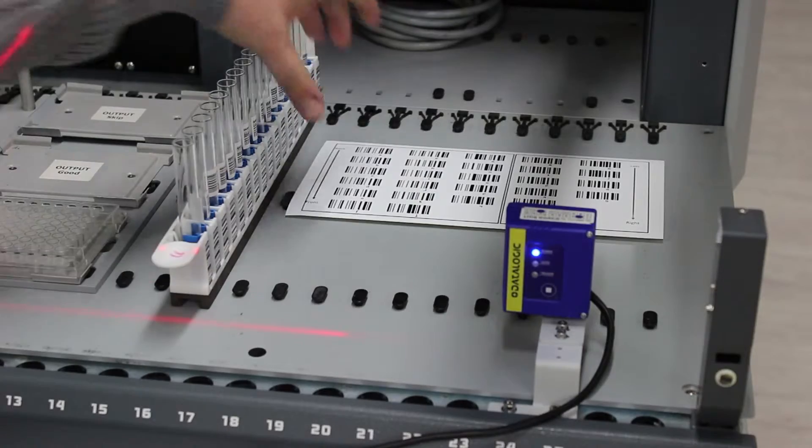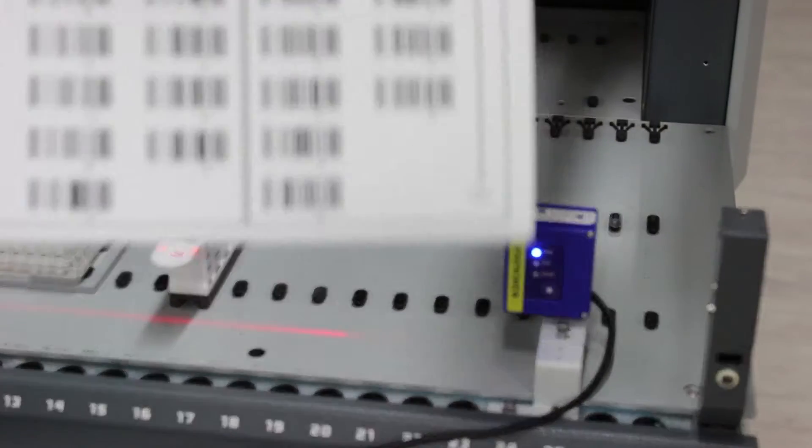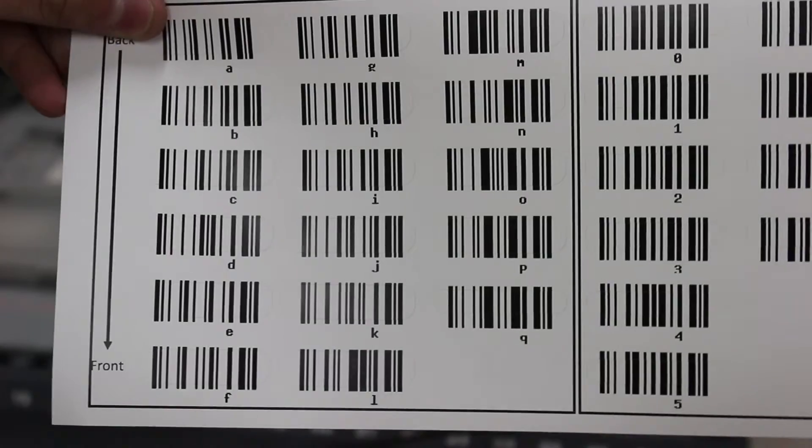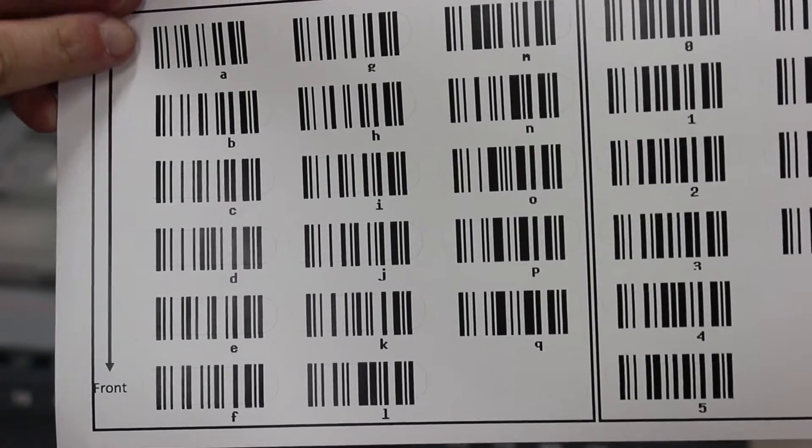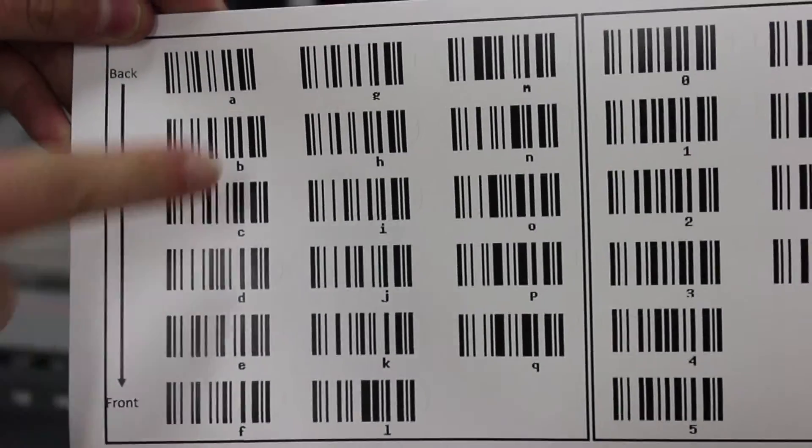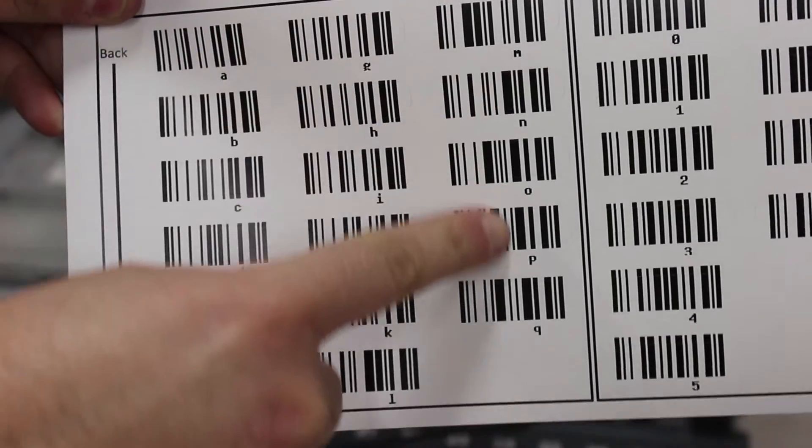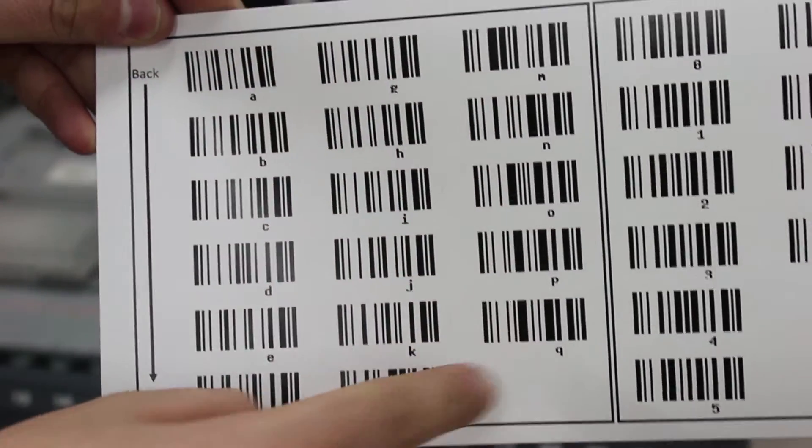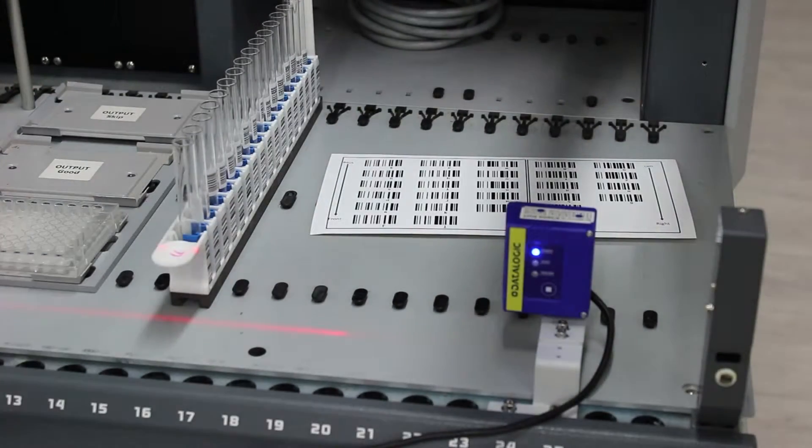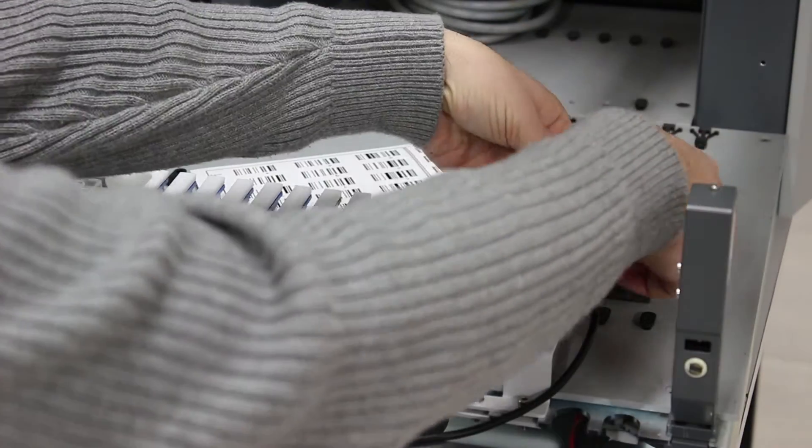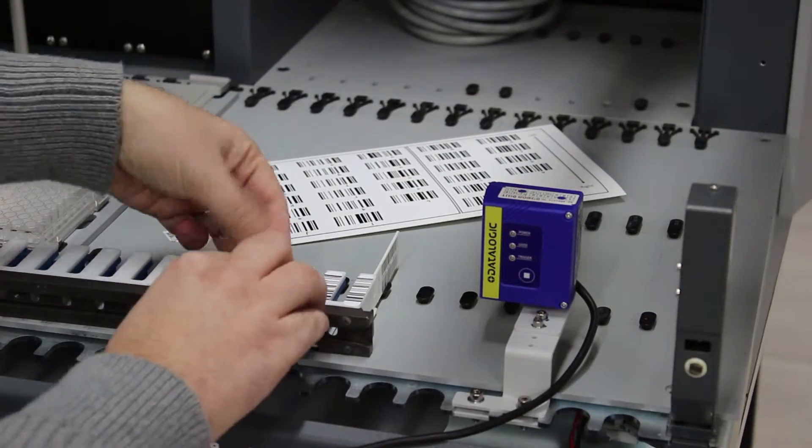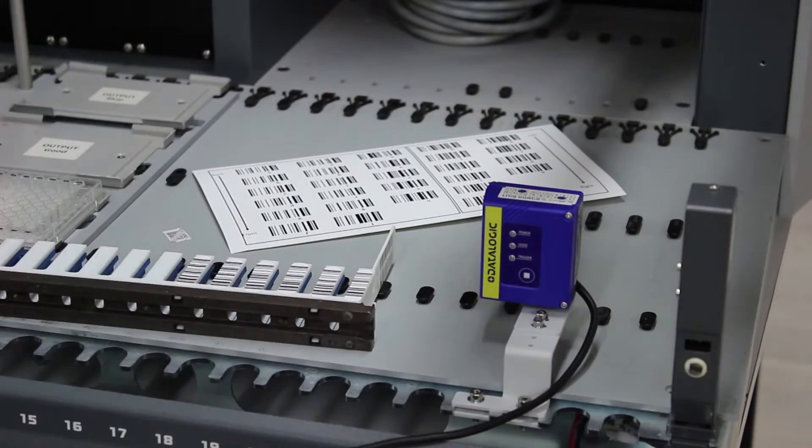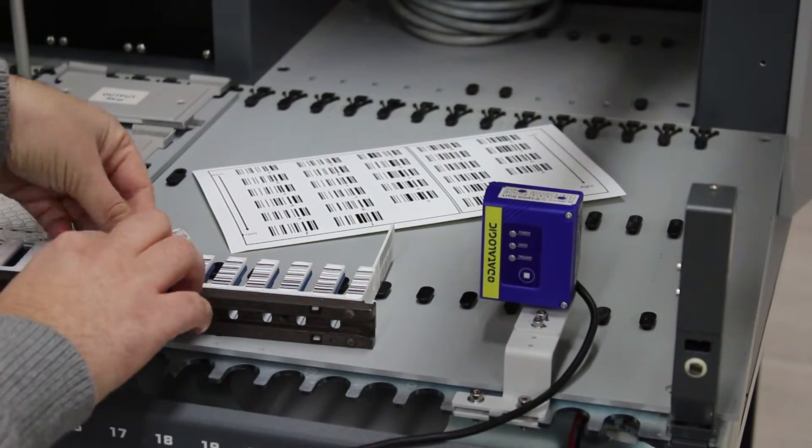Before using TubeID, we must label the tube rack using the included sticker page. The left side of the sticker page has the labels A through Q, a total of 17 stickers. We label the tube rack back to front as indicated on the sticker page. Take the first sticker, letter A, and attach it on the back position of the tube rack.